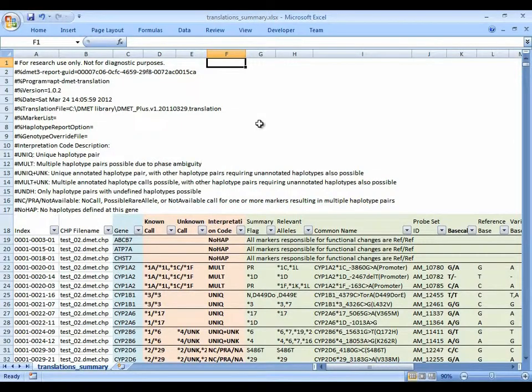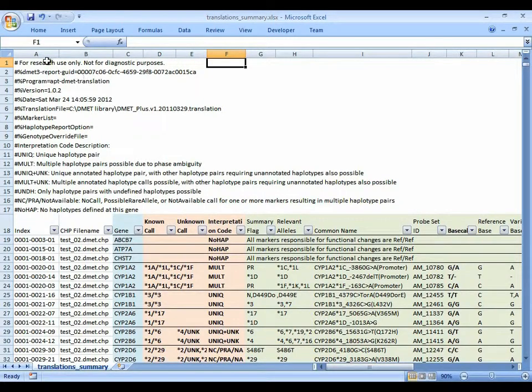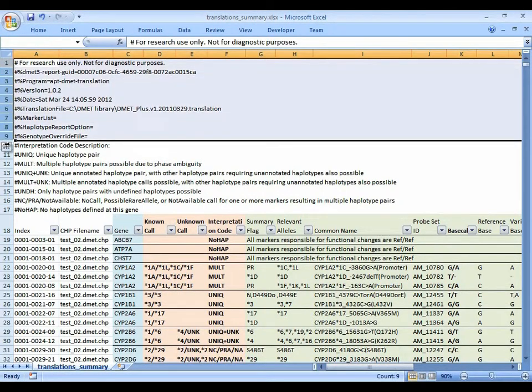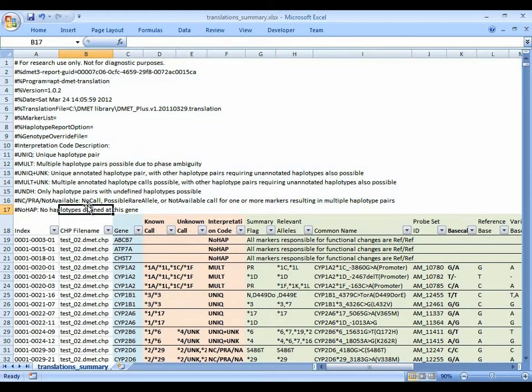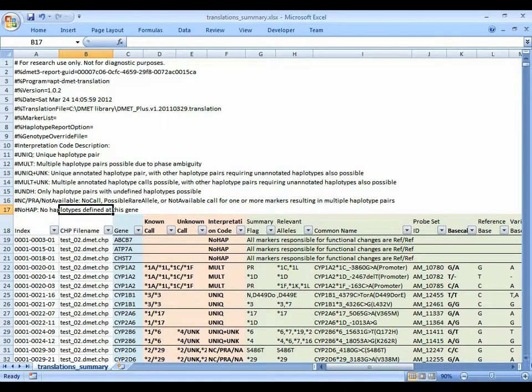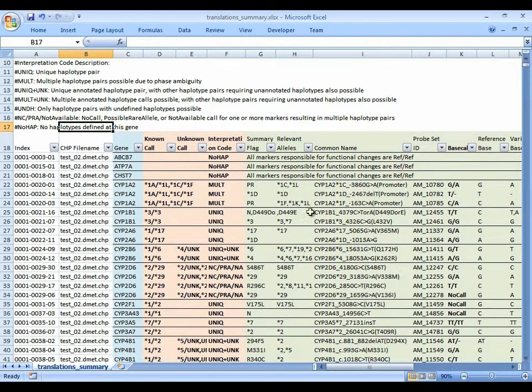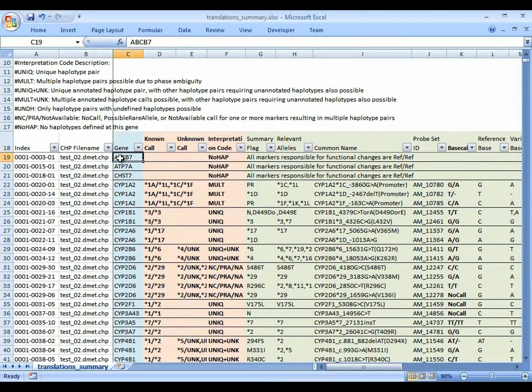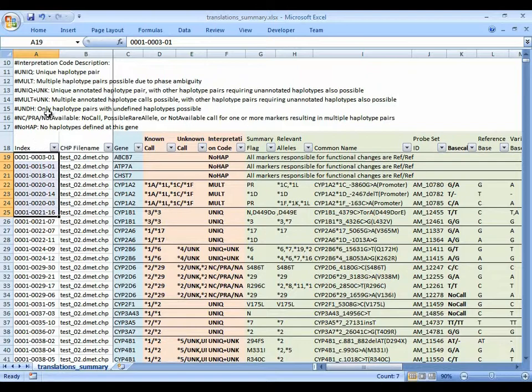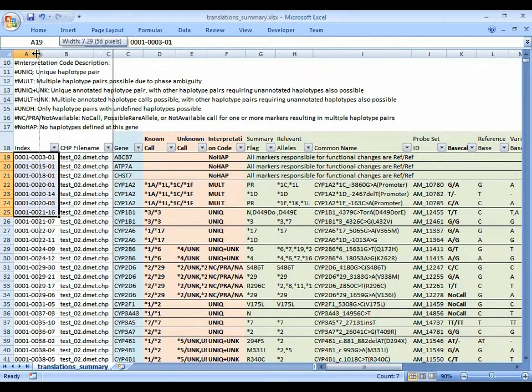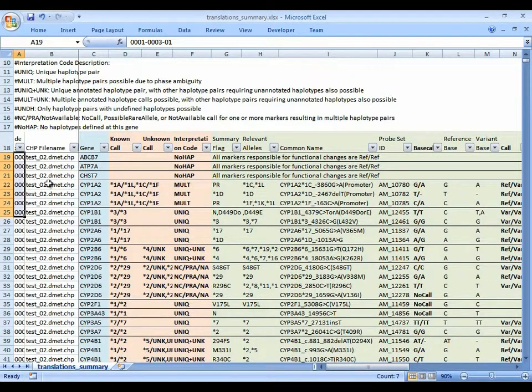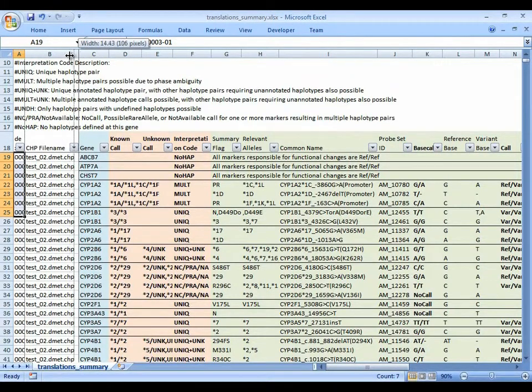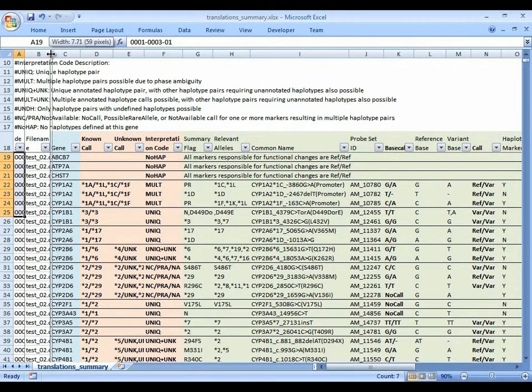I've just opened a summary report into Excel and reformatted the data sections to the same colors as the previous slide. The reports all have header information followed by the regular table. So column A is just an index for sorting the columns. Don't need to look at that anymore. Column B is the name of the chip files. So here we've got test2 to test42.